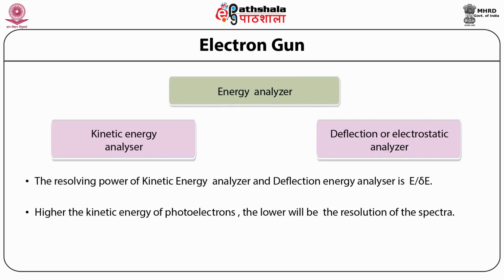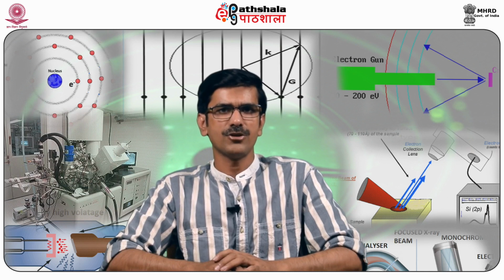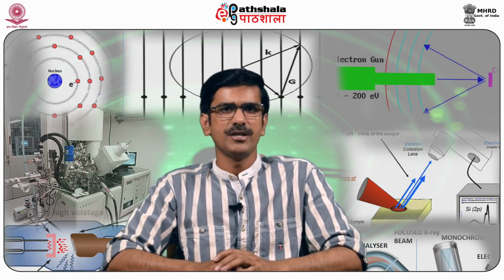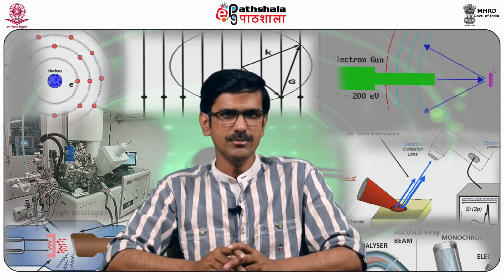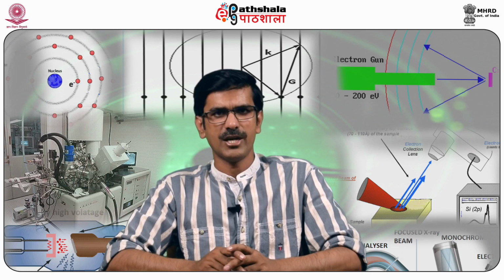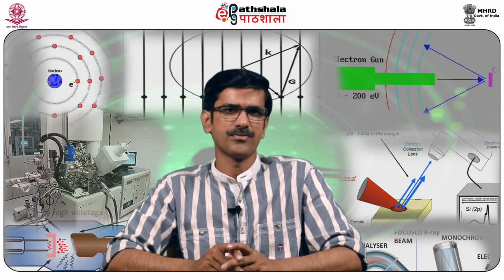The intensity of the spectra produced is also dependent on the kinetic energy. The faster the electrons are moving, the lower the resolution and the intensity.